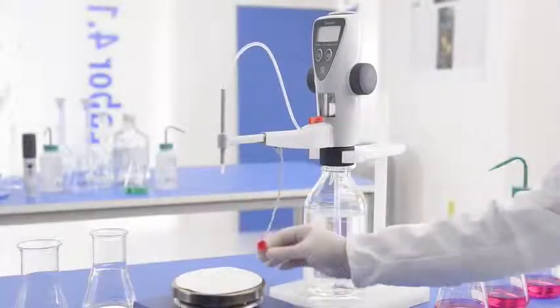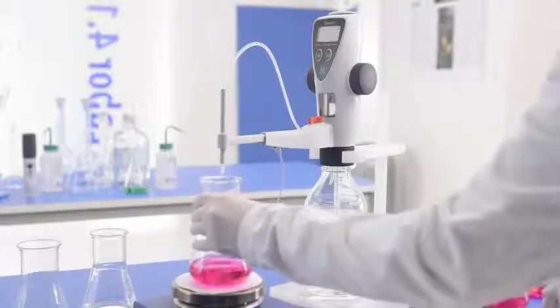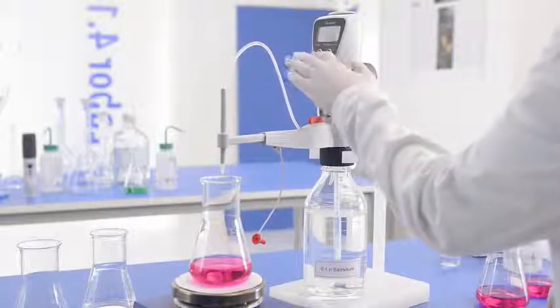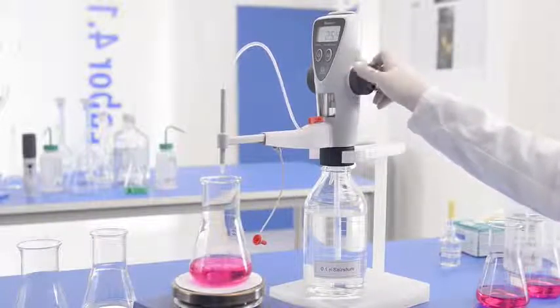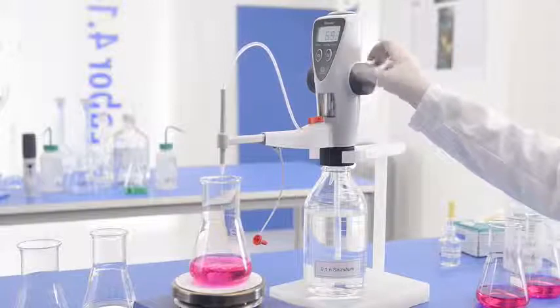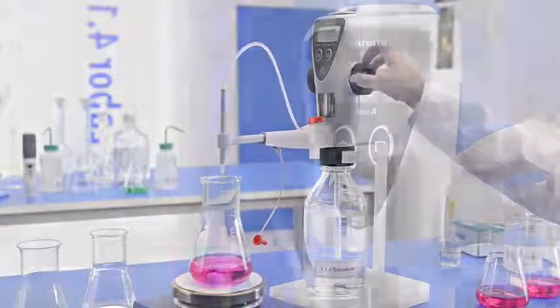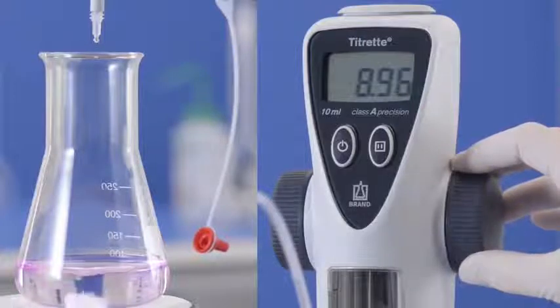This is how it's done. Place the container of test solution under the titrating tube, turn on the Titrate, and start the titration. If the approximate concentration is known, titration can proceed quickly until shortly before the end point. Then add the standard solution, drop by drop, until the color change.